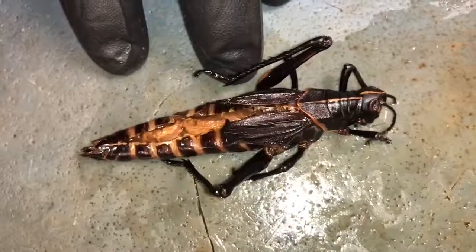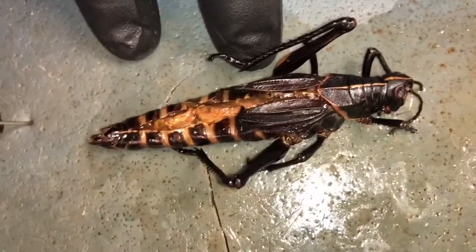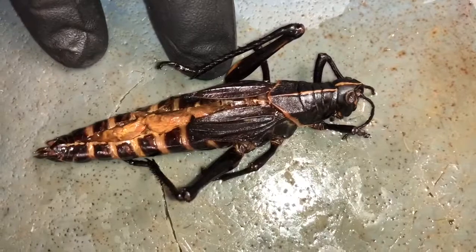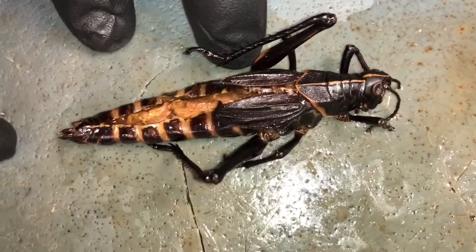Phylum Arthropoda. Subphylum Hexapoda. Class Insecta. Superorder Exopterygota. Order Orthoptera. Let's do inside first.